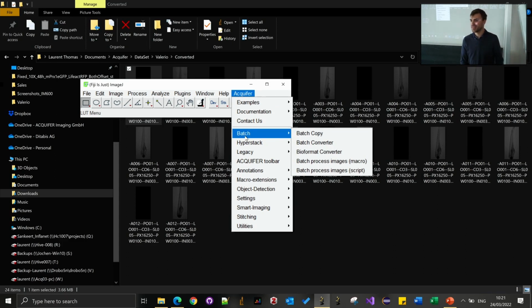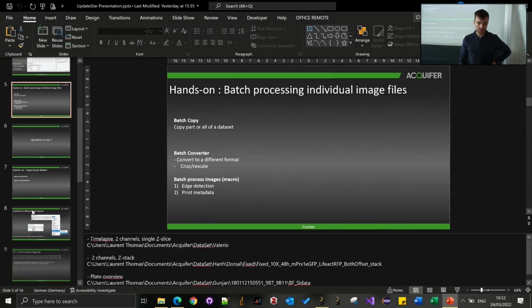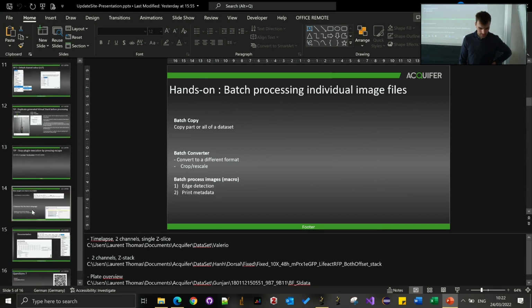Maybe. So for this raw cropping, do we use basically whatever is implemented already in Fiji? Yes. So how would it look if one would use a macro recording? So if, for example, one would like to add some extra level on top of this batch processing, yes, use a macro recorder with this batch converter. Most of the plugins are macro recordable. So basically you would get the macro recorded command with the path of the ROI. Actually, I think I can show you. And what you would have to update then is the path to your directory. So where is this? At the end, I think, here.